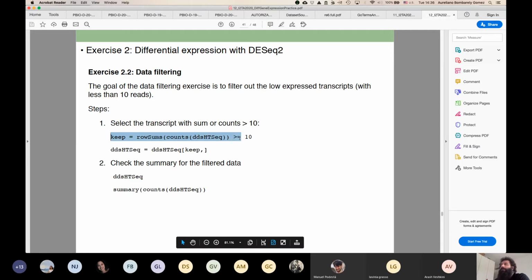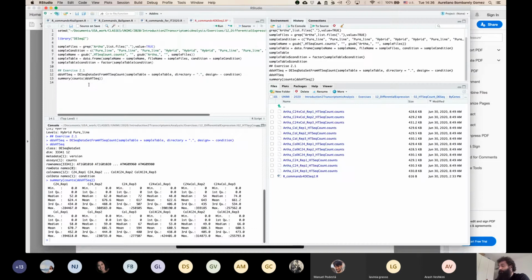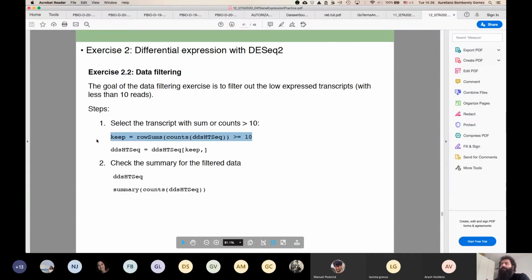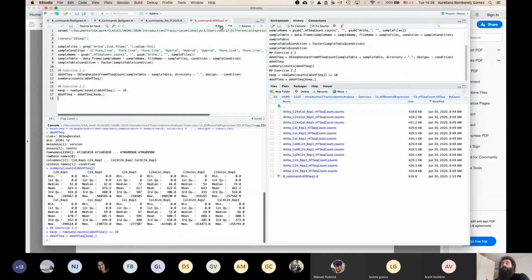So we run this command. Then I forgot something. Okay, so we run this.